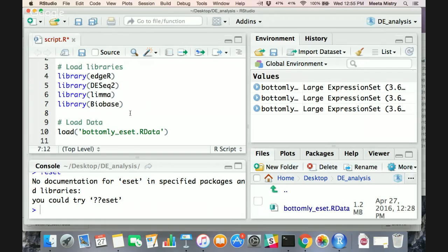Okay, yeah. So I've used mostly EdgeR before, and what I've put into it is just the table format of my counts, and I haven't converted it. So is that your original input? Is that what you use, and then create an expression set from that?